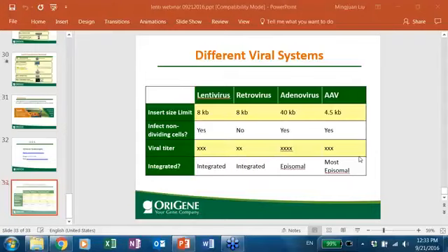Yeah, the key basically is just to make the chance for viral replication even lower. Correct. Yeah, it's safer. It also doesn't need the viral transactivator TAT. For second generation, you do need that, which will be provided in the packaging plasmids.